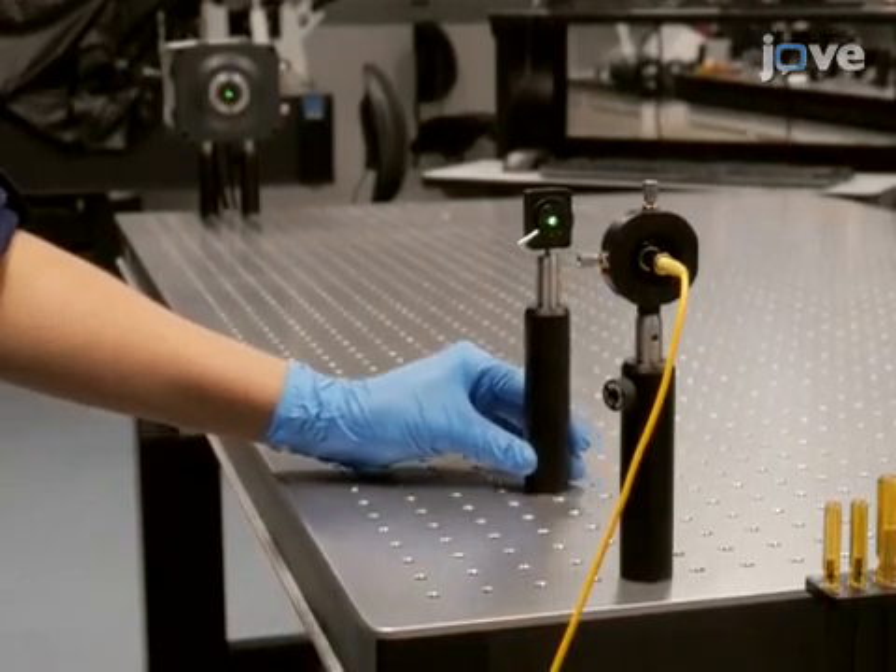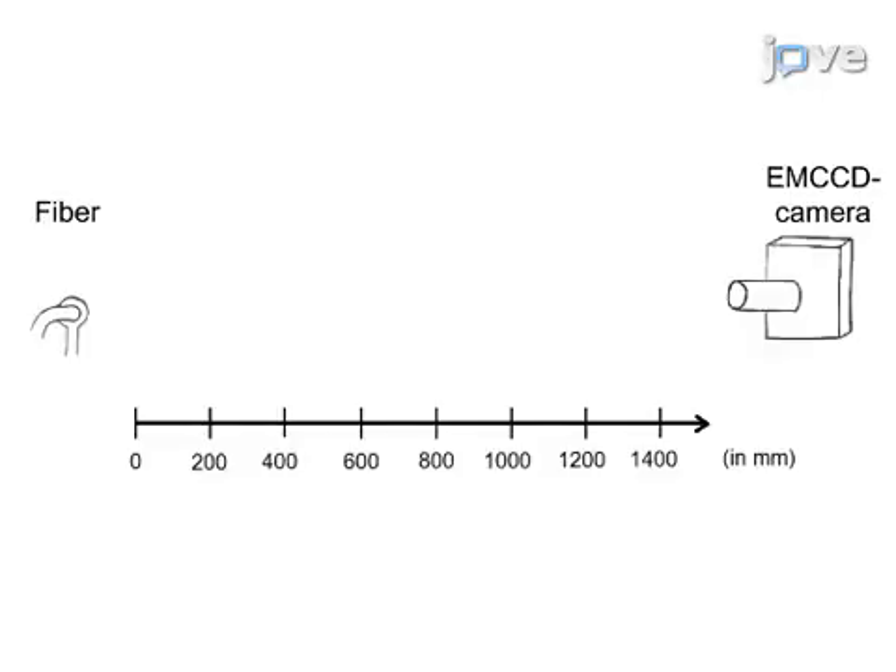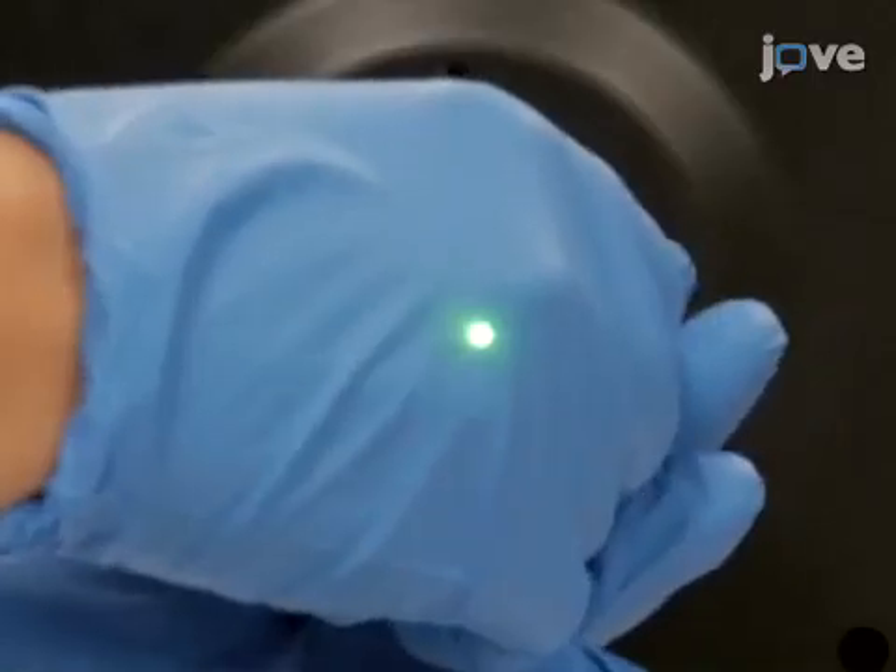Check the alignment by moving the iris along the desired optical axis. This schematic provides an overview of the setup at this point. Next, add an achromatic lens pair in front of the camera.